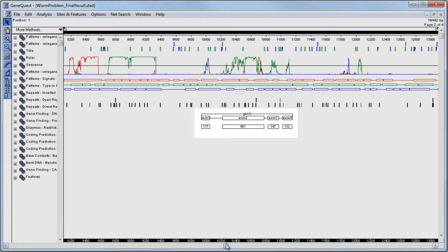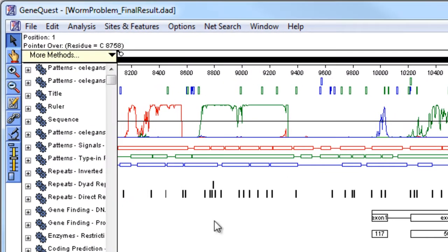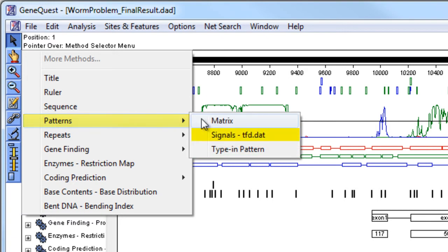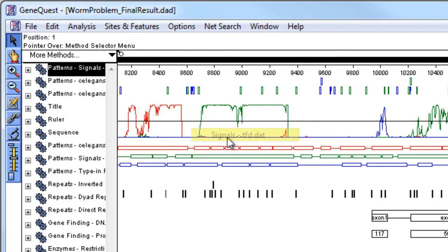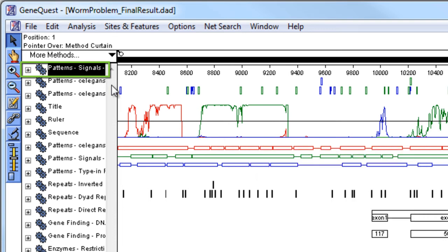To locate transcription factor binding sites, go to More Methods, Patterns, Signals, TFD.dat. This method finds transcription factor binding sites using species-specific sequence patterns.